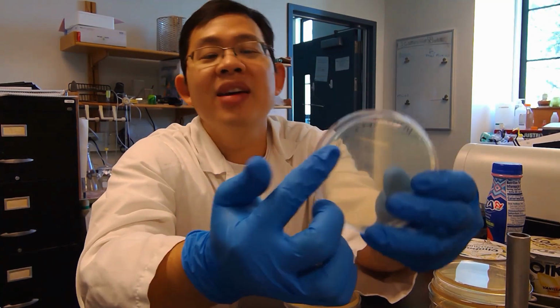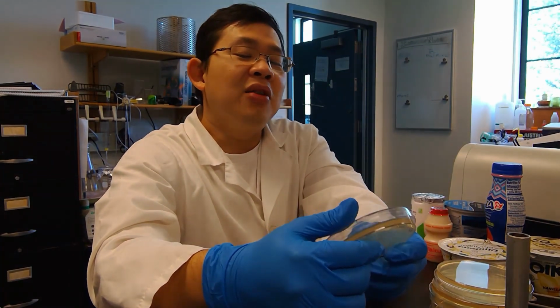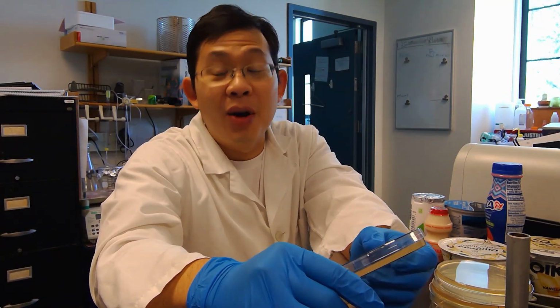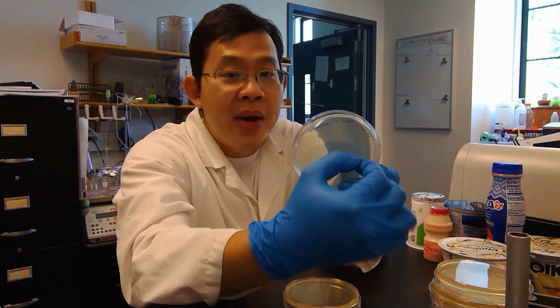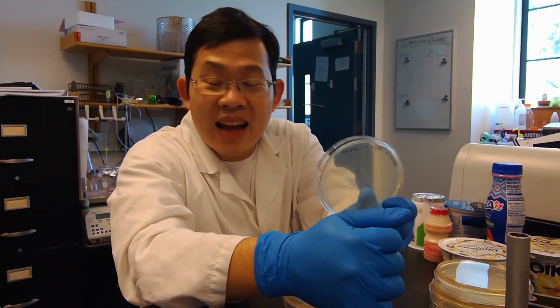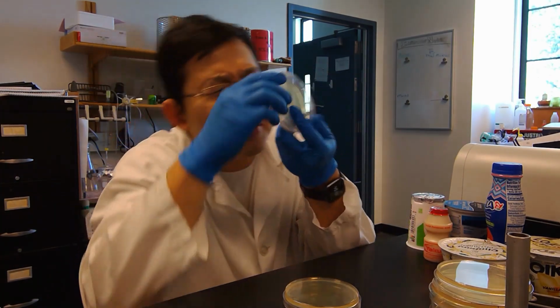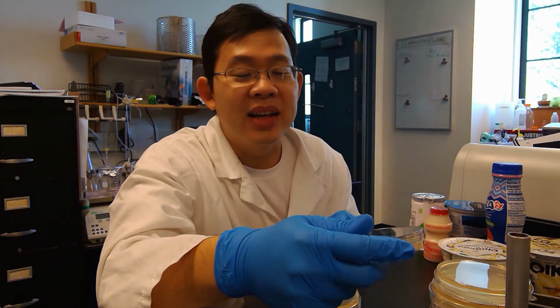The reason why you want to label it on the side is because you don't want your label to obscure your growth later on. If you imagine you put your label really big at the center, later on when your bacteria grow, you will have a hard time looking at what is there. So anyway, that's basically how you label it.